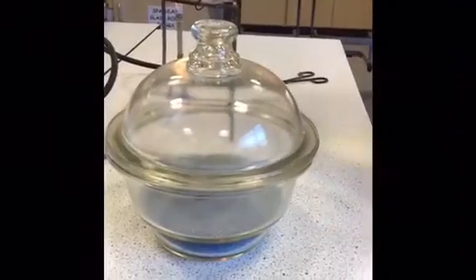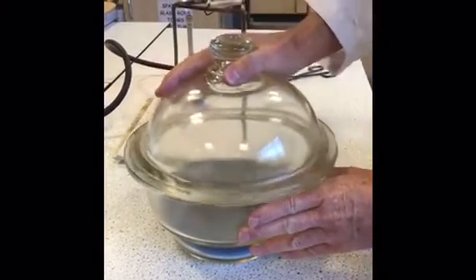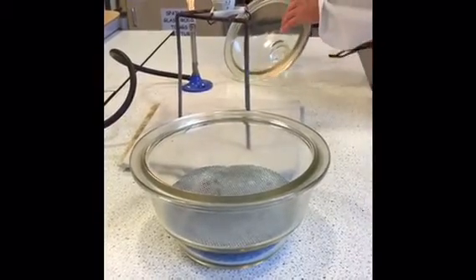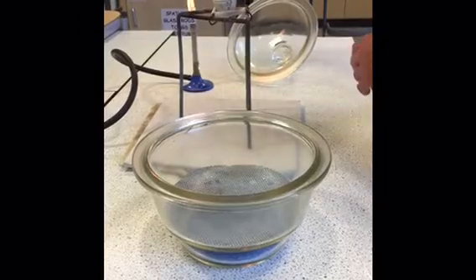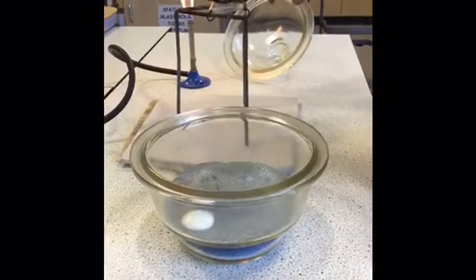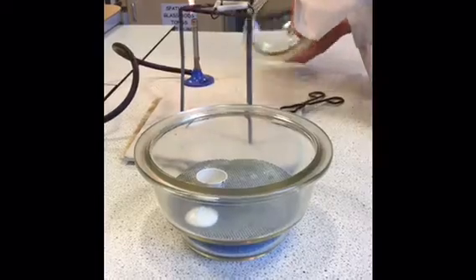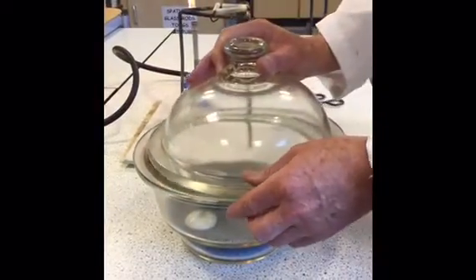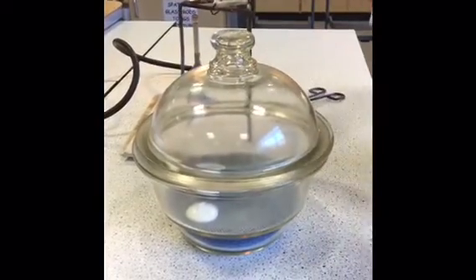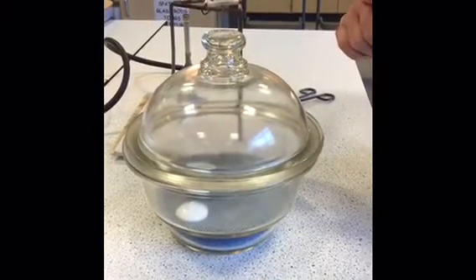Okay. So I've left it to cool for a couple of minutes. I'm now going to transfer it to the desiccator to leave it to cool for about another 10 minutes. So very carefully transfer it. And we'll leave it in there to cool for about 10 minutes. And while it cools down, it's not going to reabsorb water from the atmosphere because the desiccator keeps the moisture levels in air down to almost zero.